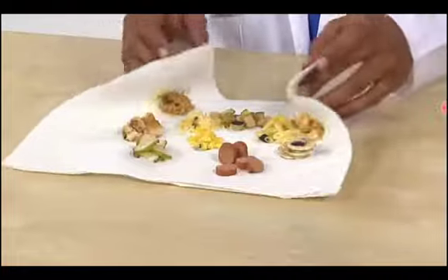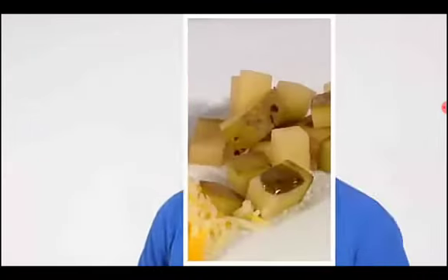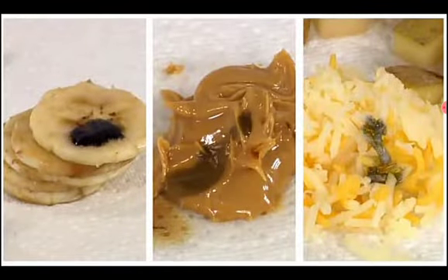Okay, all done. I'll clean up and wash my hands. So just as I suspected, the potato, the pasta, and the corn all turn black because they're starches. But I also had some surprising results. Looks like I need to make my meals a little more balanced.